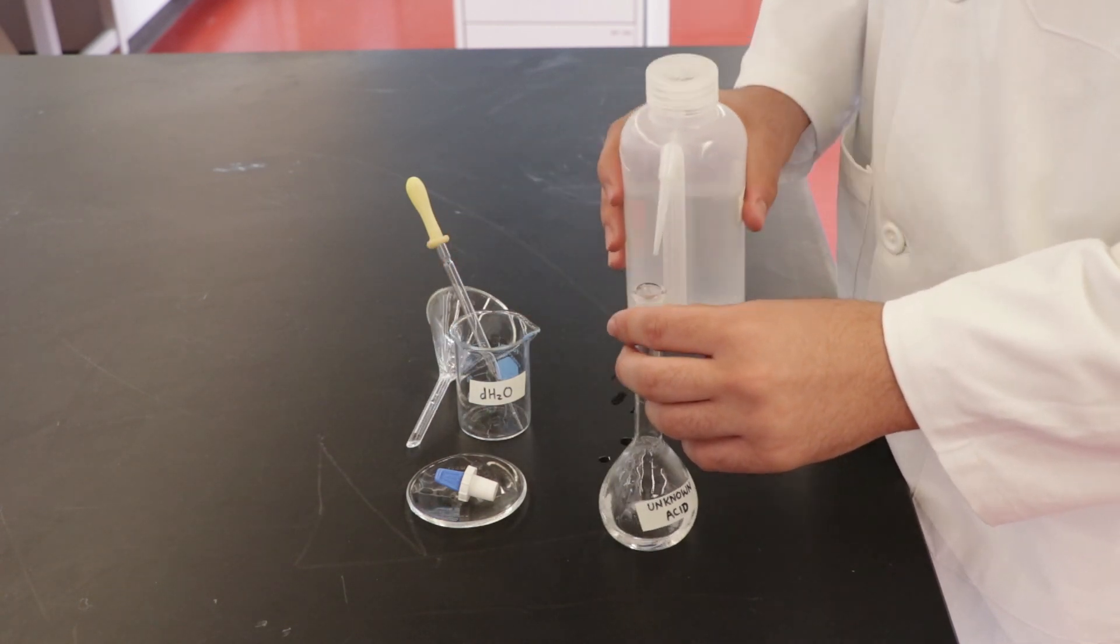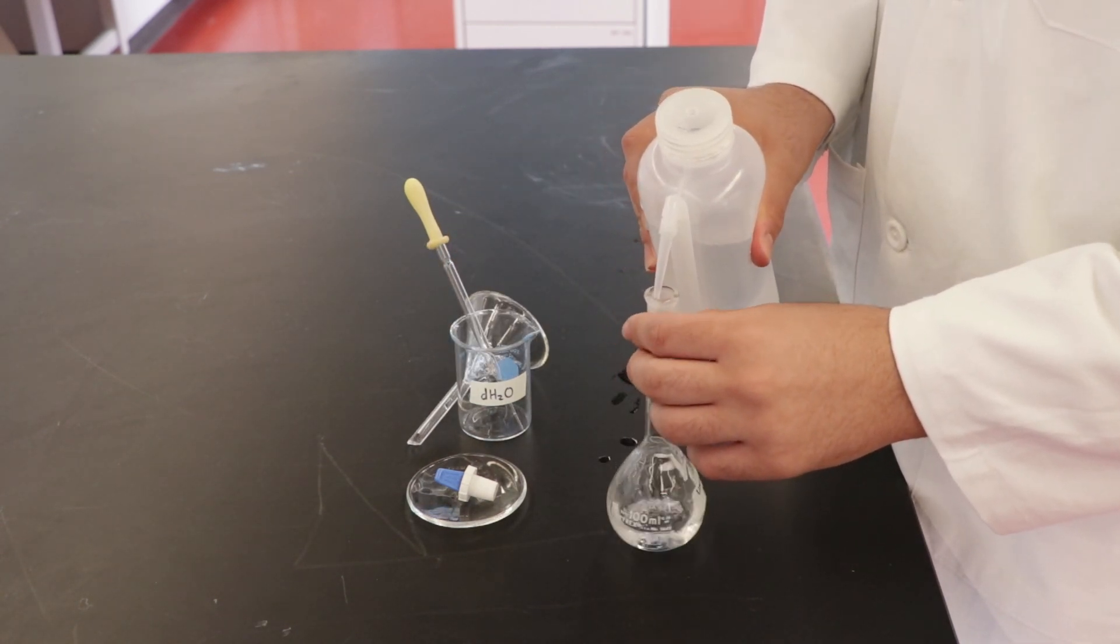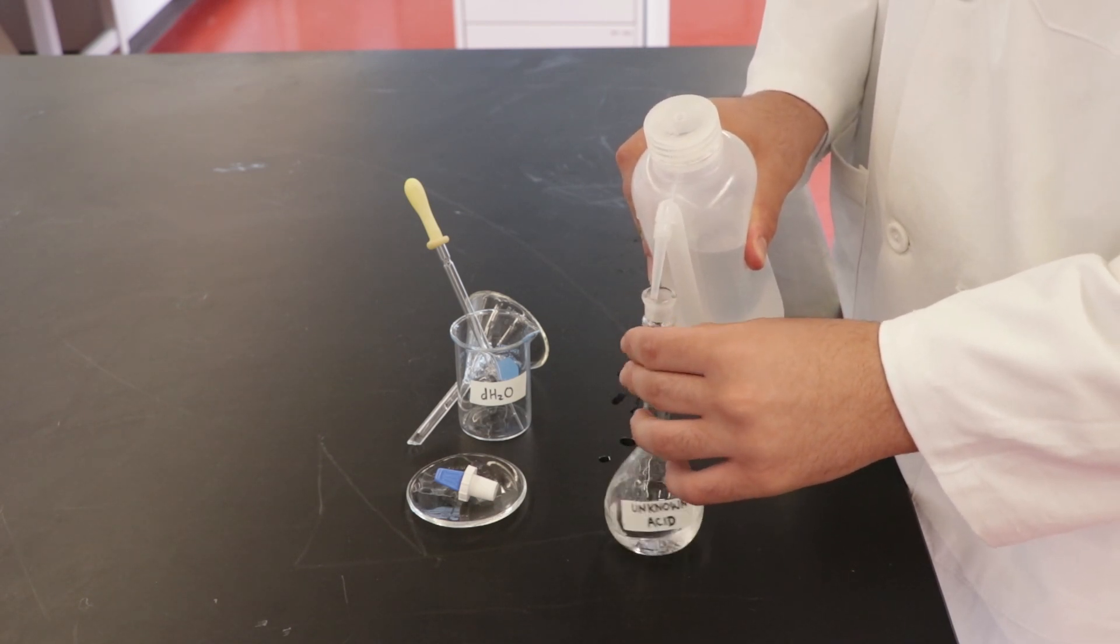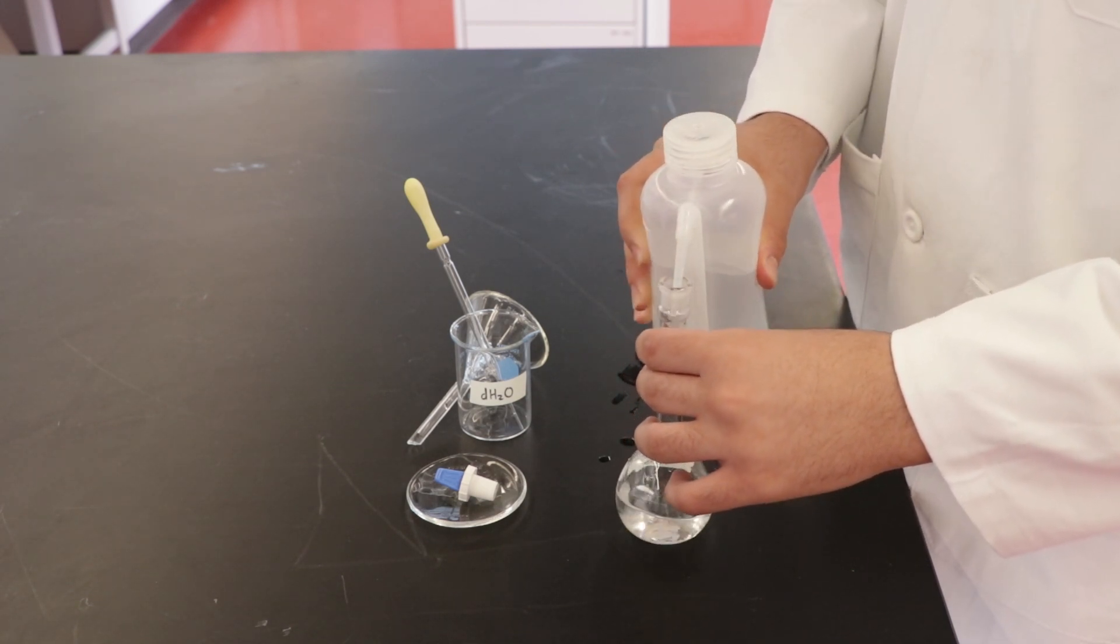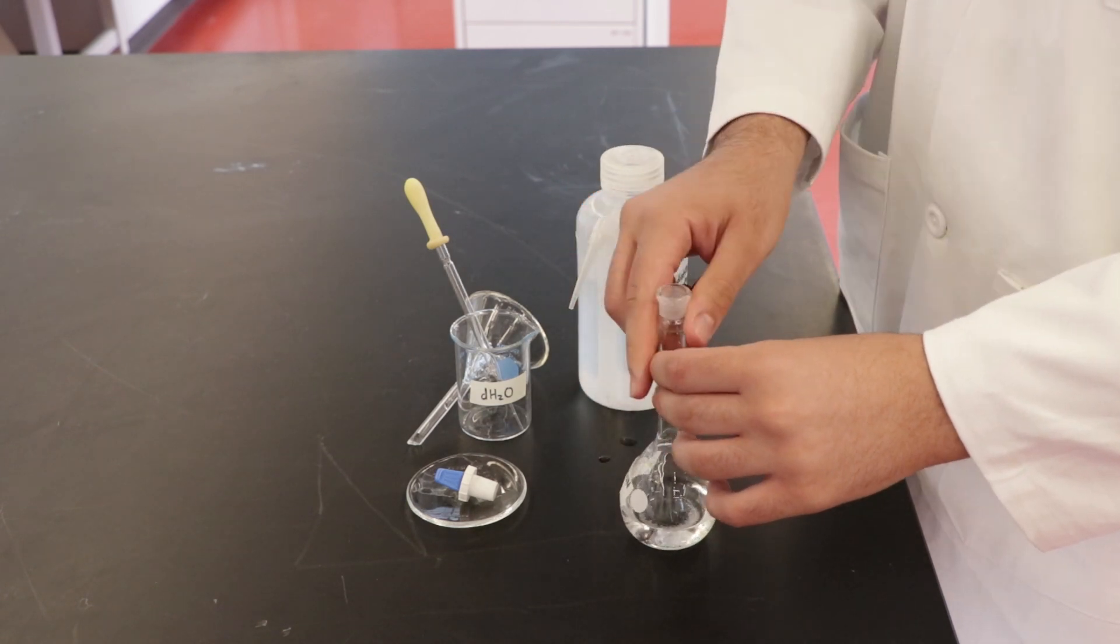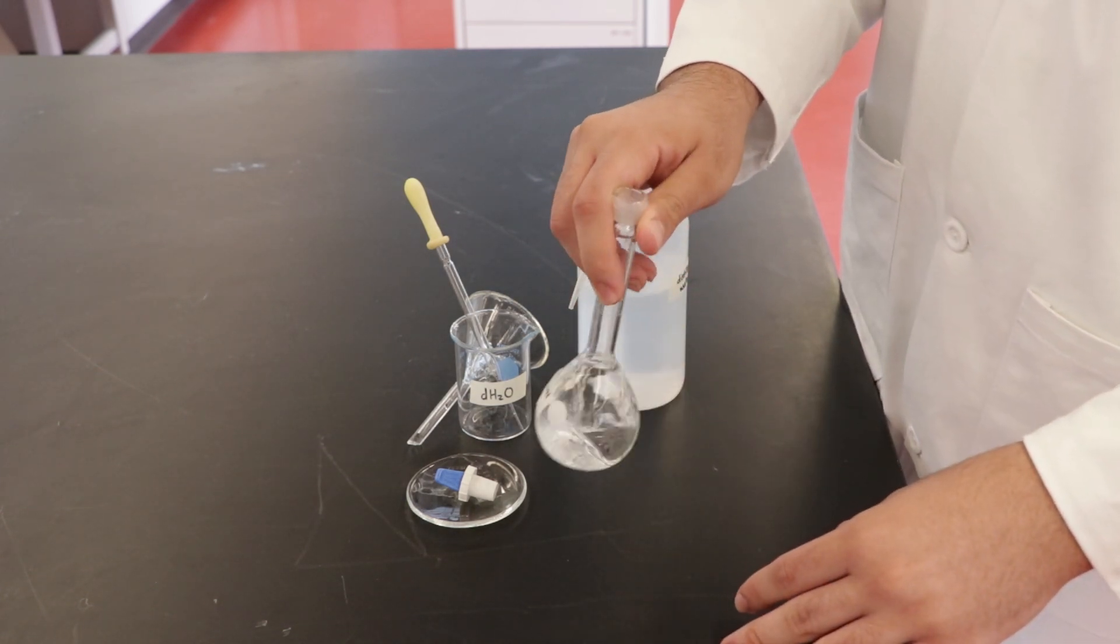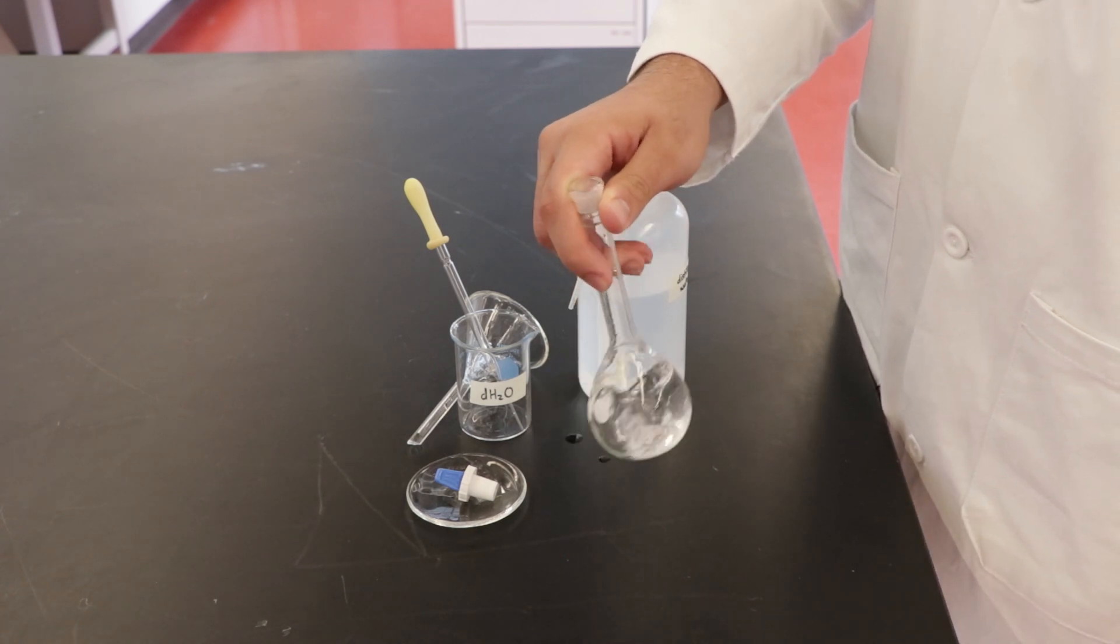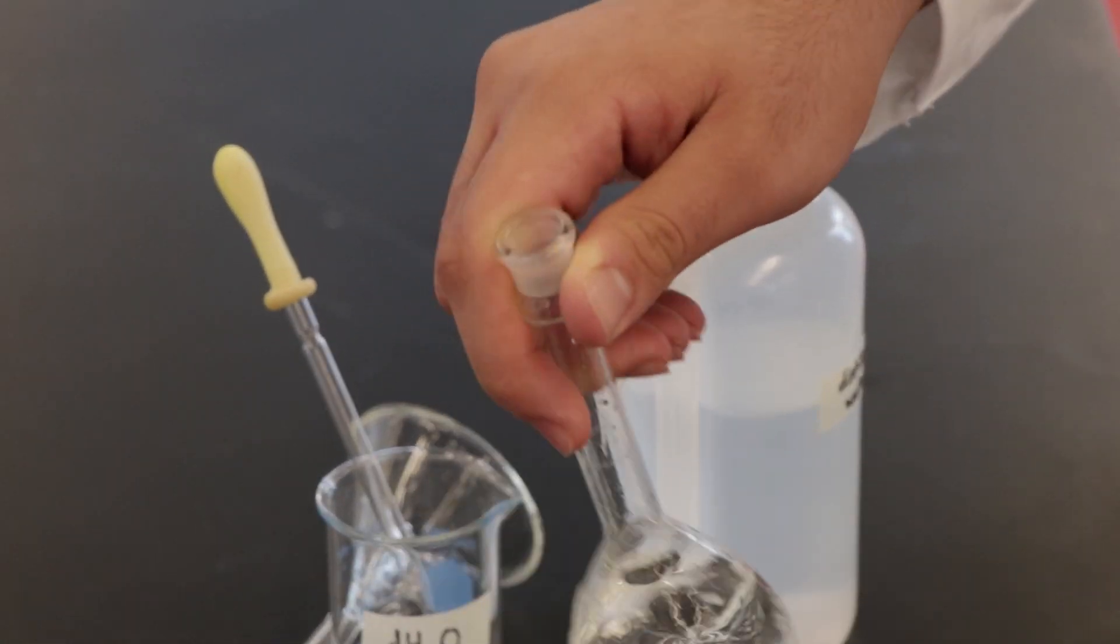To finish preparing the standard solution, add about a third of the flask volume using the wash bottle and rinse the neck of the flask while doing so. Swirl the flask to allow the acid to dissolve. It is important to dissolve all the solid before filling to the mark. Do not invert the flask at this step.